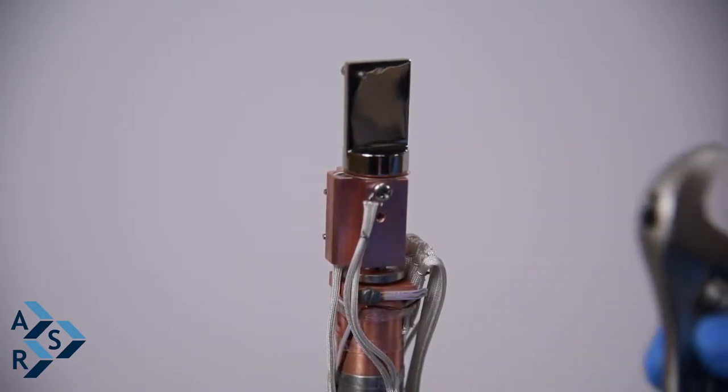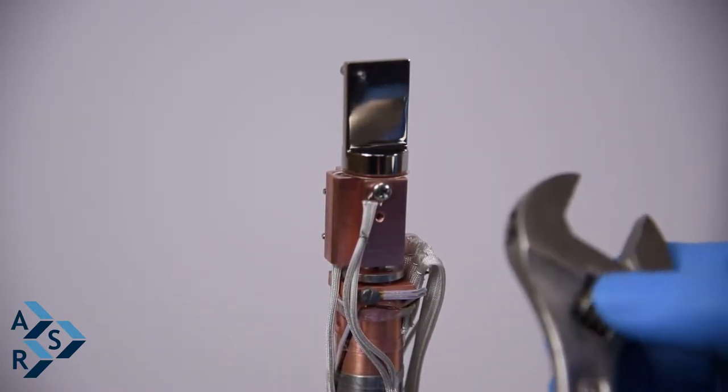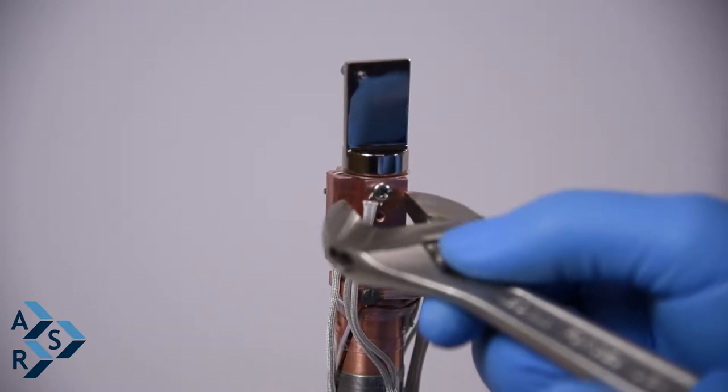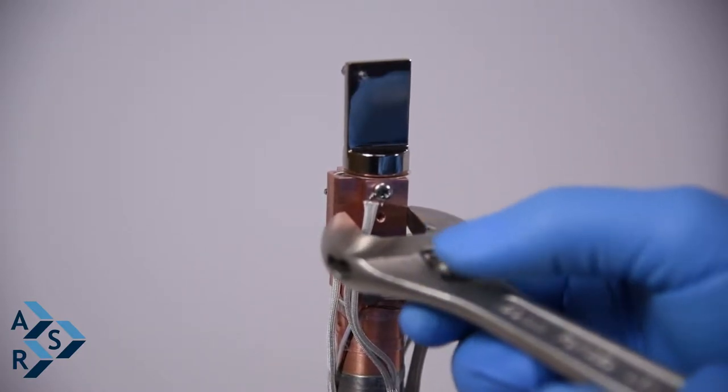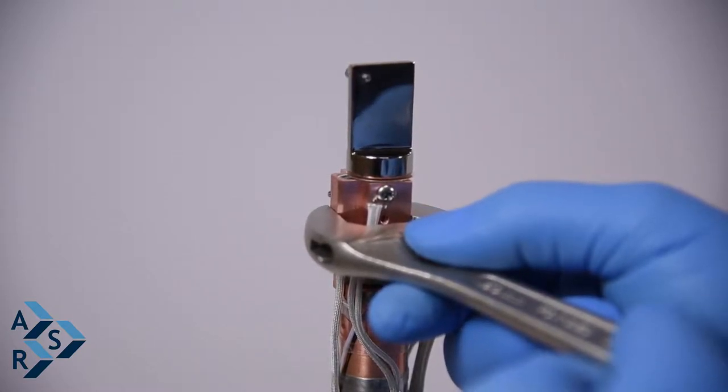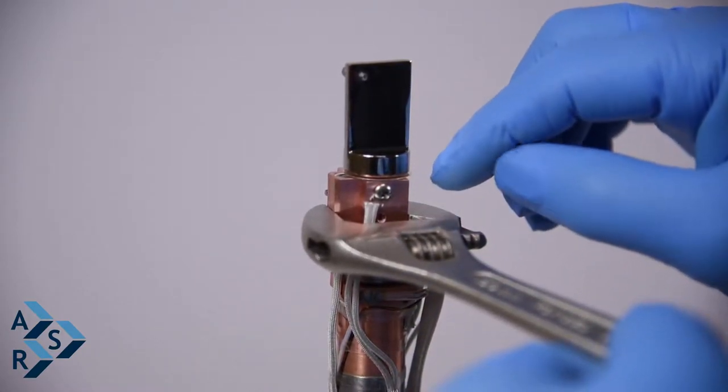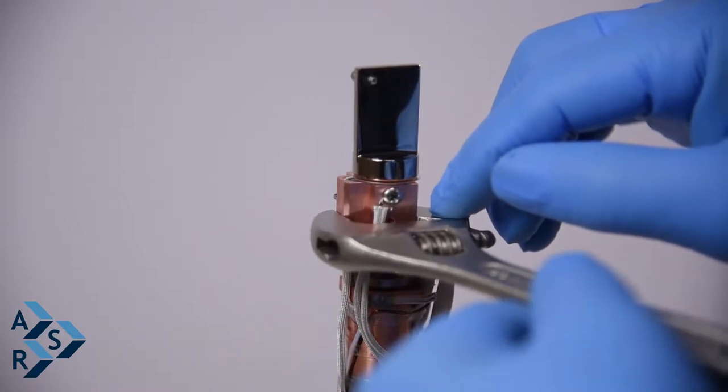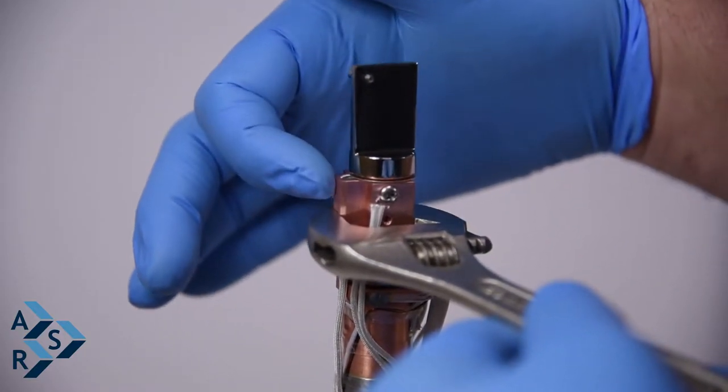What I recommend you use is an adjustable wrench, and you want to hold it at this part of the interface. Snug it. You can put electrical tape on both sides of the adjustable so you don't scar the copper.